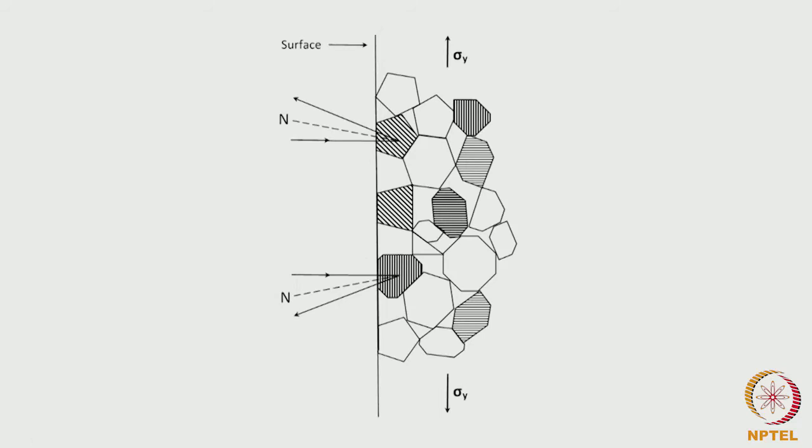If we have some grains within the material where the atomic planes are more or less parallel to the side of the sample, and if we have a beam of X-rays falling more or less perpendicularly, it will make a small angle, but it will still be called a normal incidence. And if we can get the diffracted beams, like this is the normal to the planes, this is the incident beam, this is the diffracted beam, although it will be making some angle, we can consider it to be a normal incidence of X-rays.